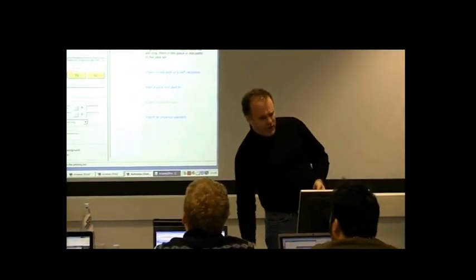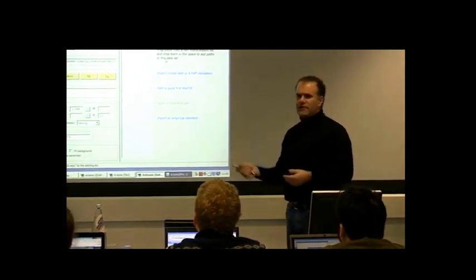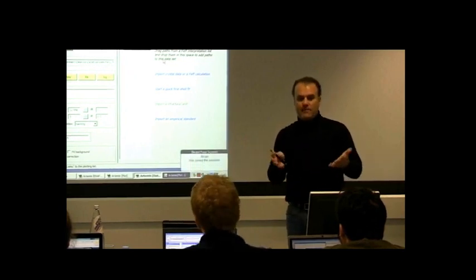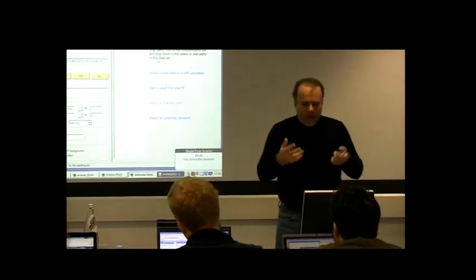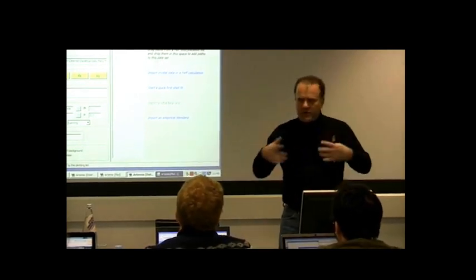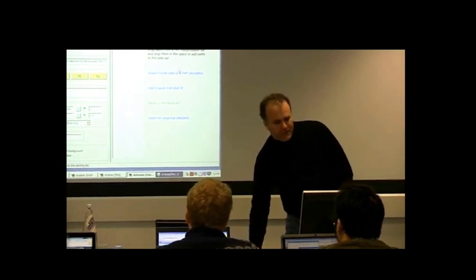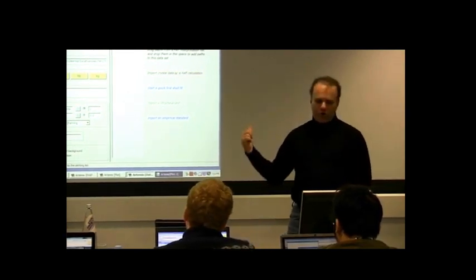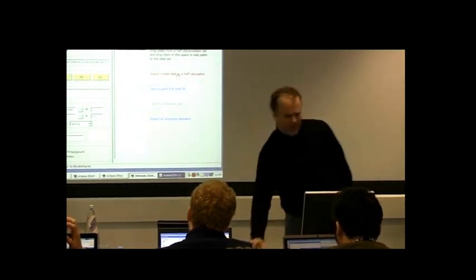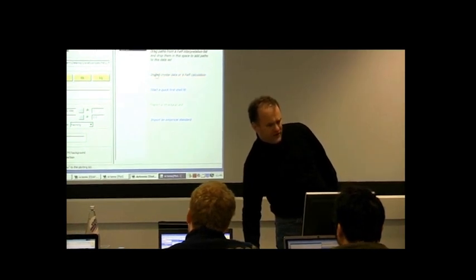So because this is a crystalline material, and the data is collected on something that was probably like a powder spread on tape or something like that, I'm going to do the FEFF calculation on the crystalline material, and then we'll start to see how to think about the two things together. So the next step at this point is to import crystal data. There's a whole bunch of ways to do this. Clicking that place right there does the same thing as clicking this right here. There's a bunch of ways to get started on this.